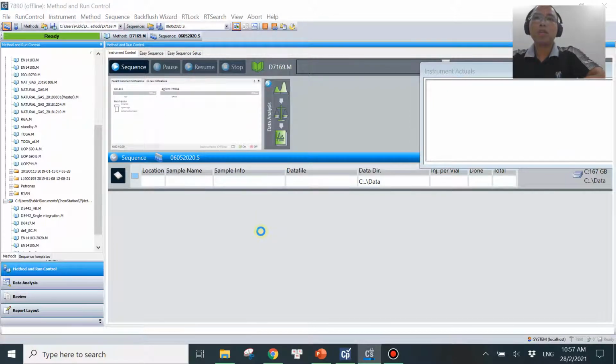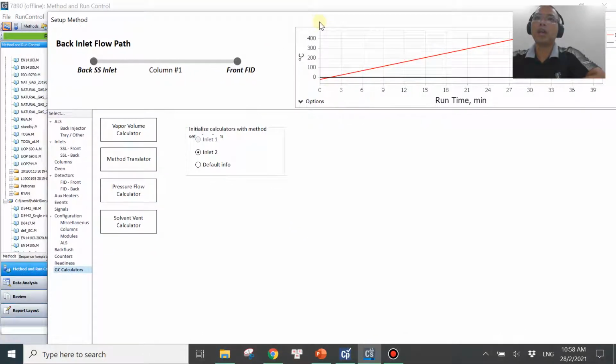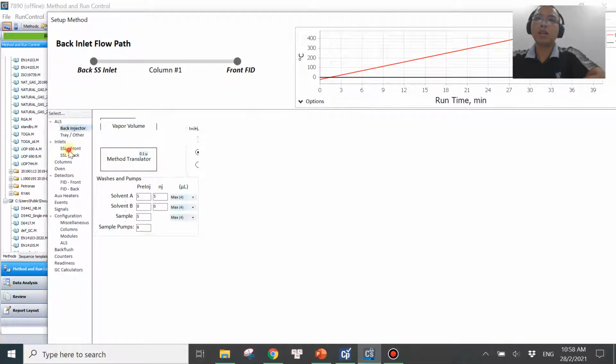Depending on what version you are using, you should be able to find this calculator inside one of the CDs. It's called, I don't remember correctly, something like user manuals and training. I think there are 3 CDs, but only one of them will have this calculator. And once you open this one, these are the typical parameters.